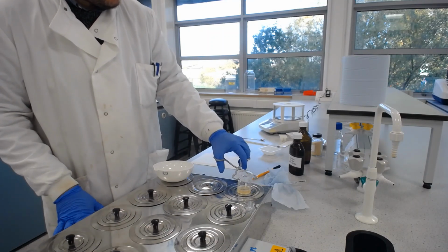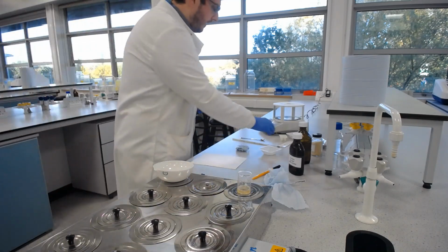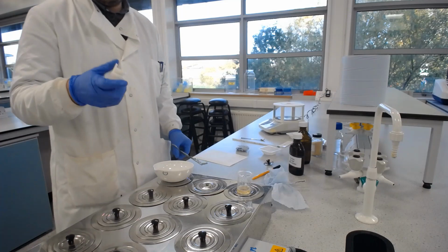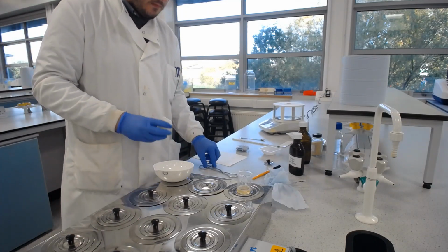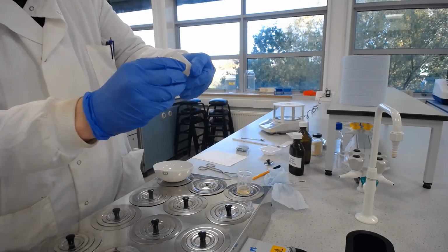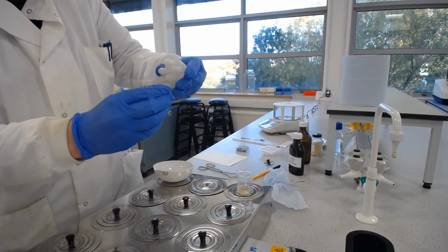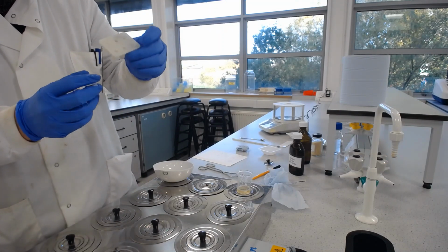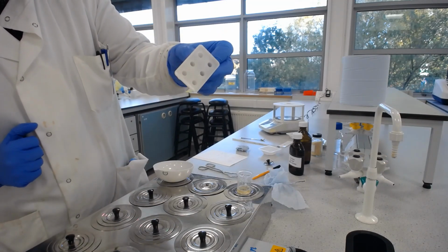So I'm just going to get the mould over here now, because we don't want to let this cool down too much before we pour it. Before we pour it, we do just want to make sure on this mould that all of the caps are in place. So these caps will get taken off at the end of the process. We need to make sure that they're all in place, otherwise you're just going to pour straight out the bottom. And this is where we're going to pour into.